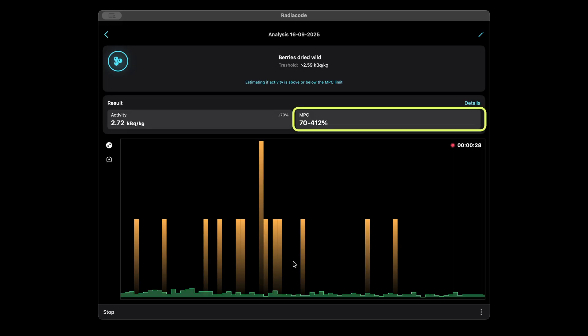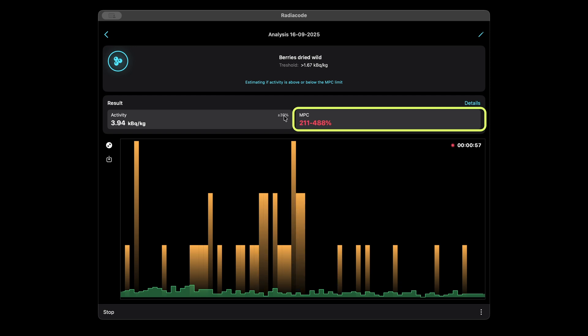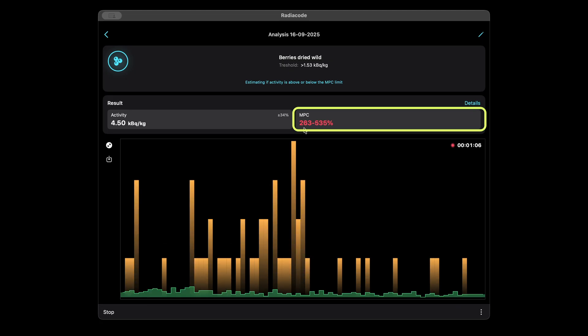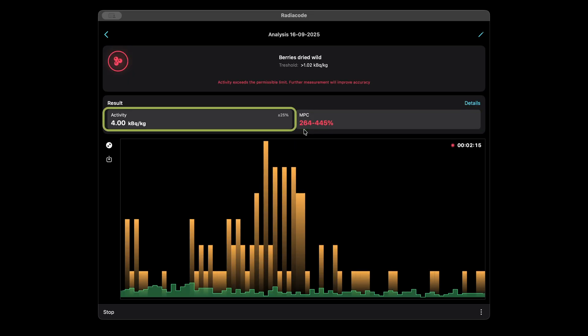Understanding the results. MPC — maximum permissible concentration — is the key parameter to look at. Two values are shown, indicating the uncertainty range. Over time, as statistics accumulate, this range narrows. If the range stays below 100% — for example, 0 to 90% — the sample has less than 90% of the limit and can be considered safe. Unlike essential minerals such as potassium, calcium, zinc, and iron, cesium-137 is not naturally present in the human body and is undesirable in any amount.